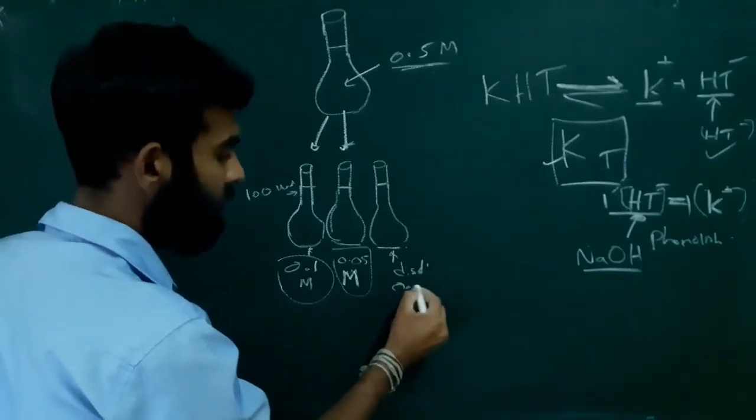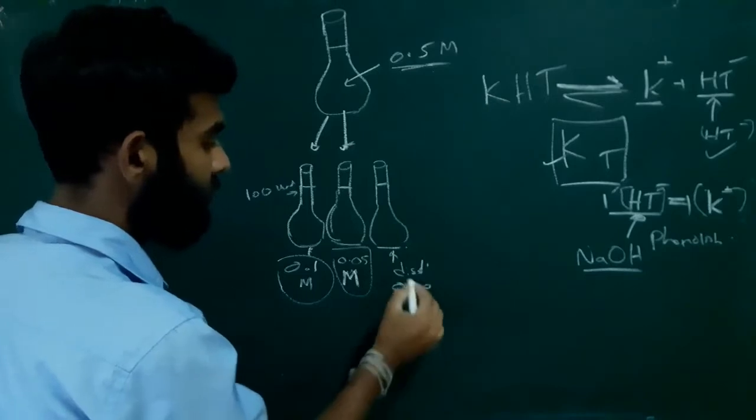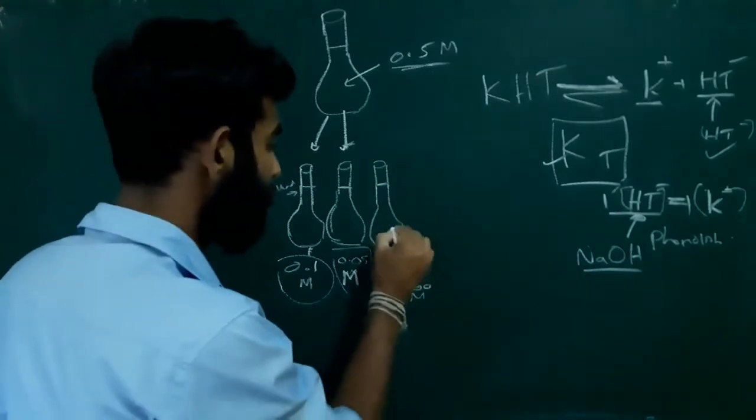It is 0.00 M sodium sulfate. Actually, there is no sodium sulfate in this fourth solution.